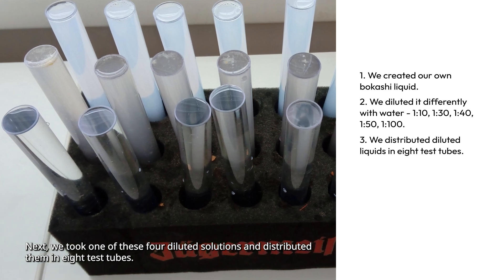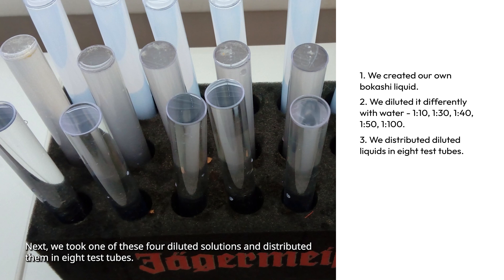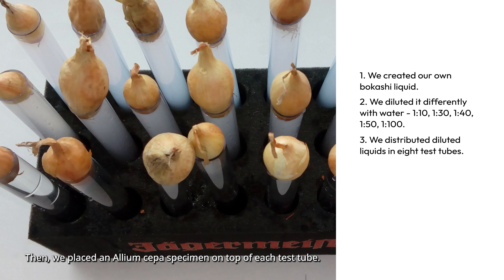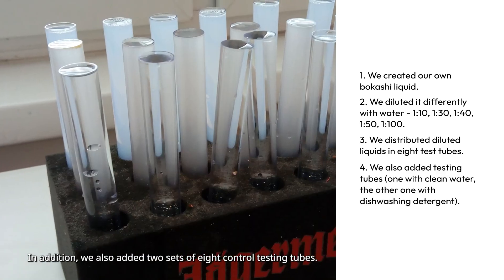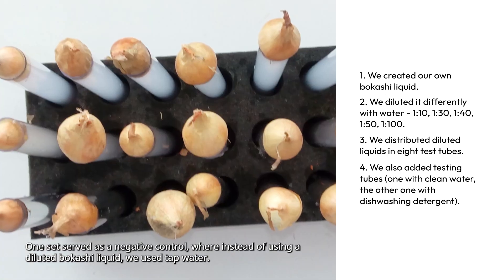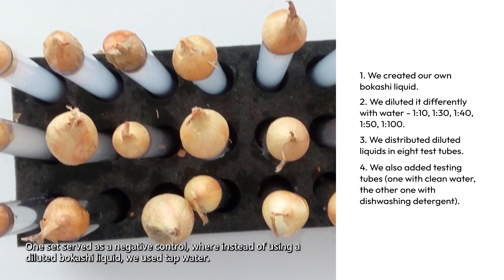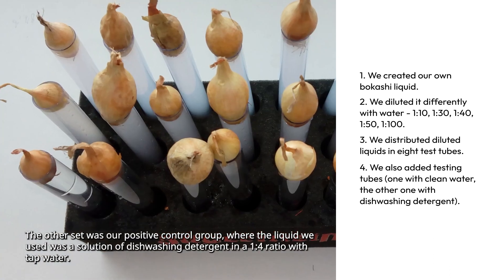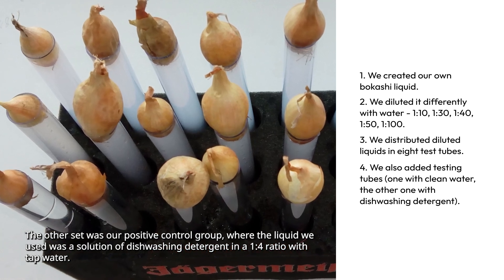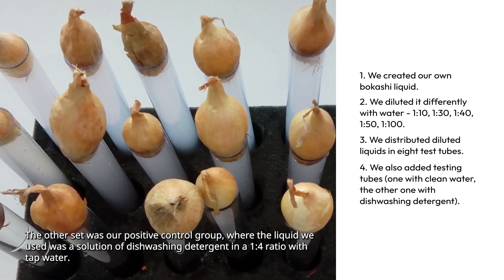Next, we took one of these four diluted solutions and distributed them in eight test tubes, then placed an Allium Cepa specimen on top of each test tube. In addition, we also added two sets of eight control test tubes: one that served as a negative control, where instead of using diluted Bokashi liquid we used tap water, and the other set was our positive control group, where the liquid used was a solution of dish washing detergent in a 1 to 4 ratio with tap water.